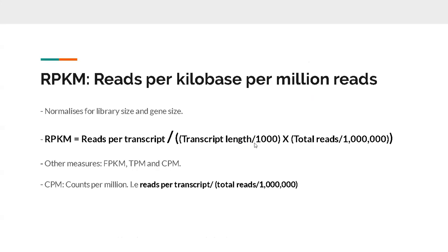And just to normalize it to a number that can be compared, you then further take per base, kilobase, because the average length of a gene in bacteria is 1,000 base pairs. And then you also divide the total number of reads by 1 million to scale it to a factor that can be comparable. So all you're doing in this expression is normalizing the raw reads that you're getting with the length of the gene and the total number of reads, or your sequencing depth.